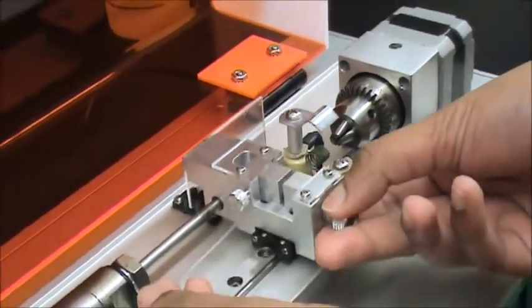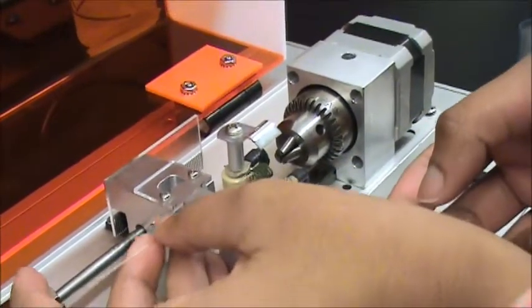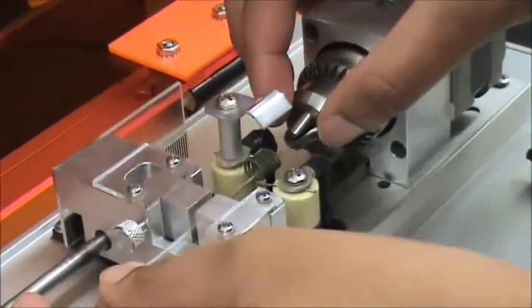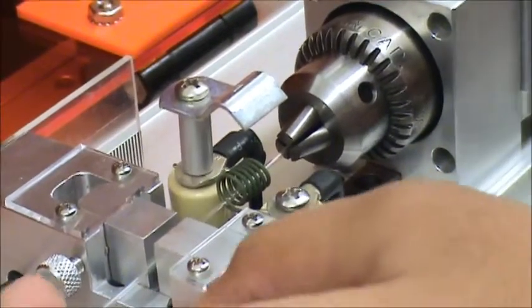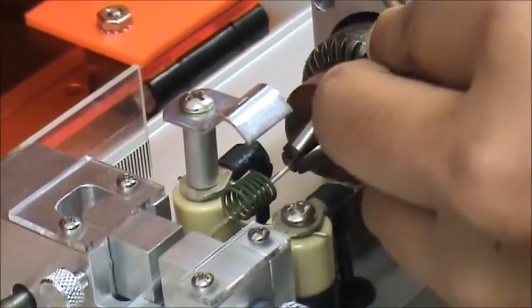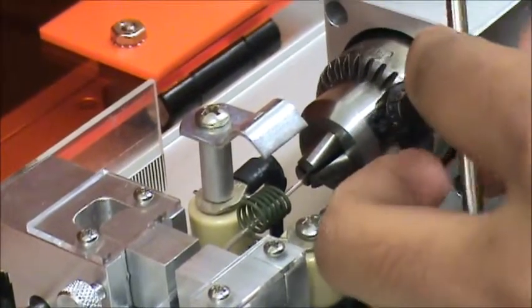So we're going to put this in, gently put it in through the coil and into here. Then we're going to tighten this a little bit, not too tight, to make sure it doesn't break.